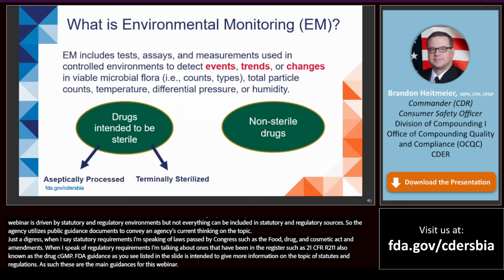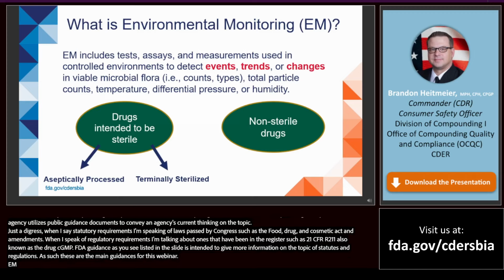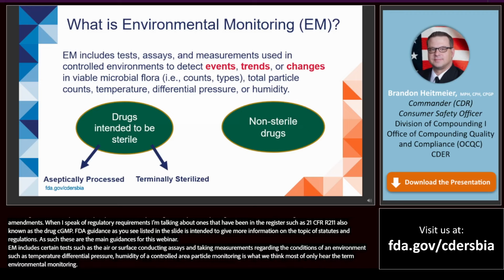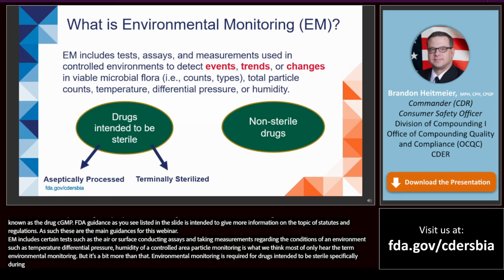EM includes conducting certain tests, like sampling the air or surface, conducting assays, and taking measurements regarding the conditions of an environment, such as the temperature, the differential pressure or humidity of a controlled area. Particle monitoring is what we think most of when we hear the term environmental monitoring, but it's a bit more than that. Environmental monitoring is required in production of drugs intended to be sterile, specifically during aseptic processing and at certain steps in terminally sterilized operations.